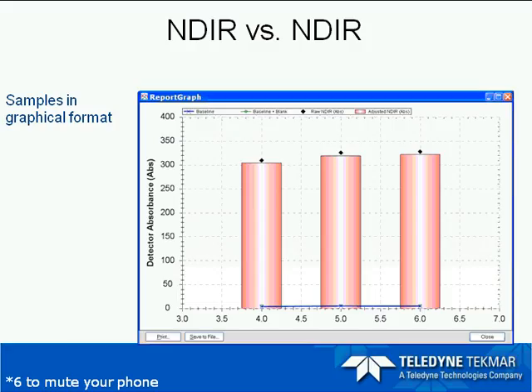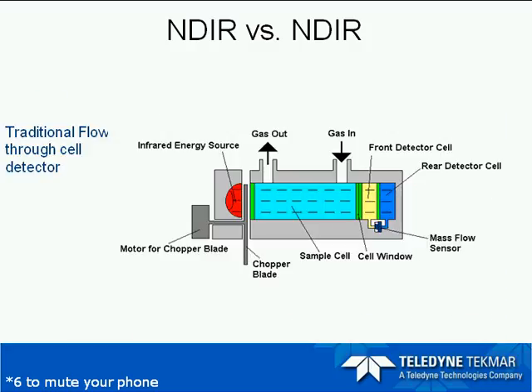Then that gives you your adjusted absorbance count of your sample. That then correlates to the CO2 inside the sample, and is then converted to ppm of carbon inside the sample, just as it was before with flow cell technology. So let's go into depth to show you the differences in the detectors, and talk a few minutes first about flow-through cell technology.